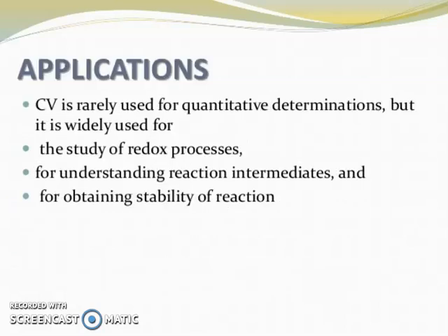So, what are the applications of cyclic voltammetry? CV is rarely used for quantitative determinations, but it is widely used for the study of redox processes, for understanding reaction intermediates, and for obtaining stability of reaction products.